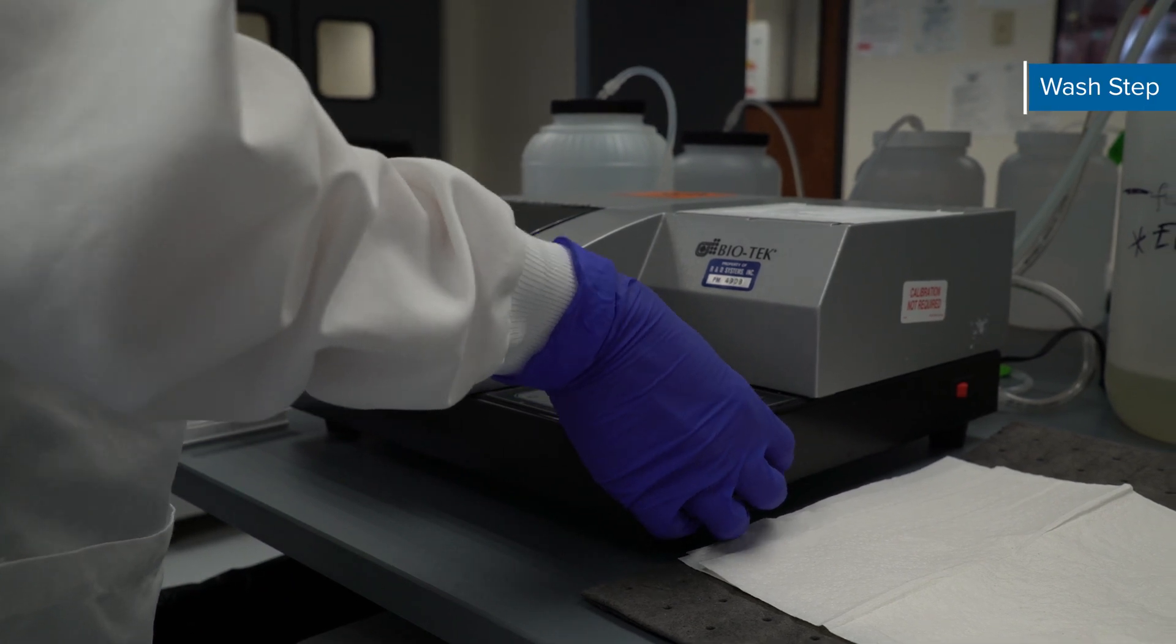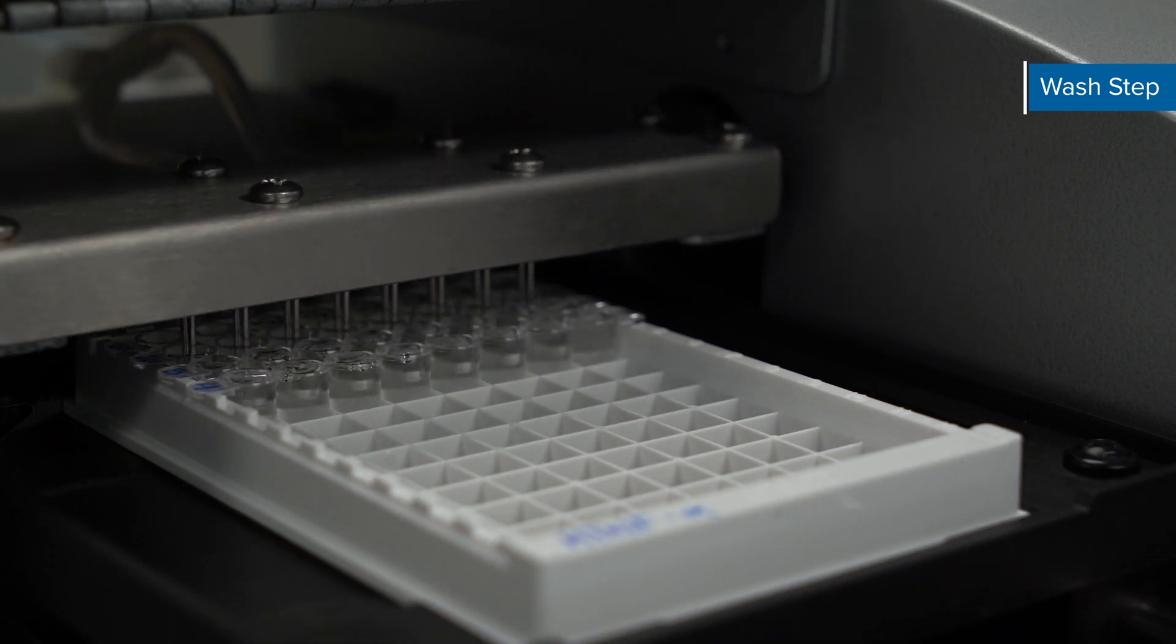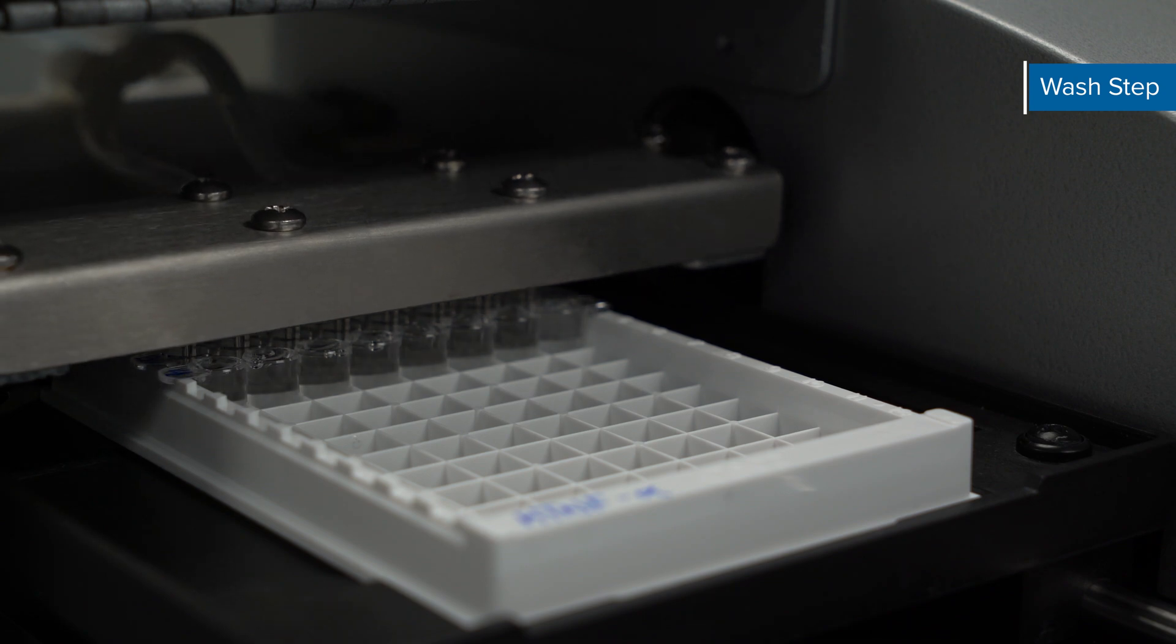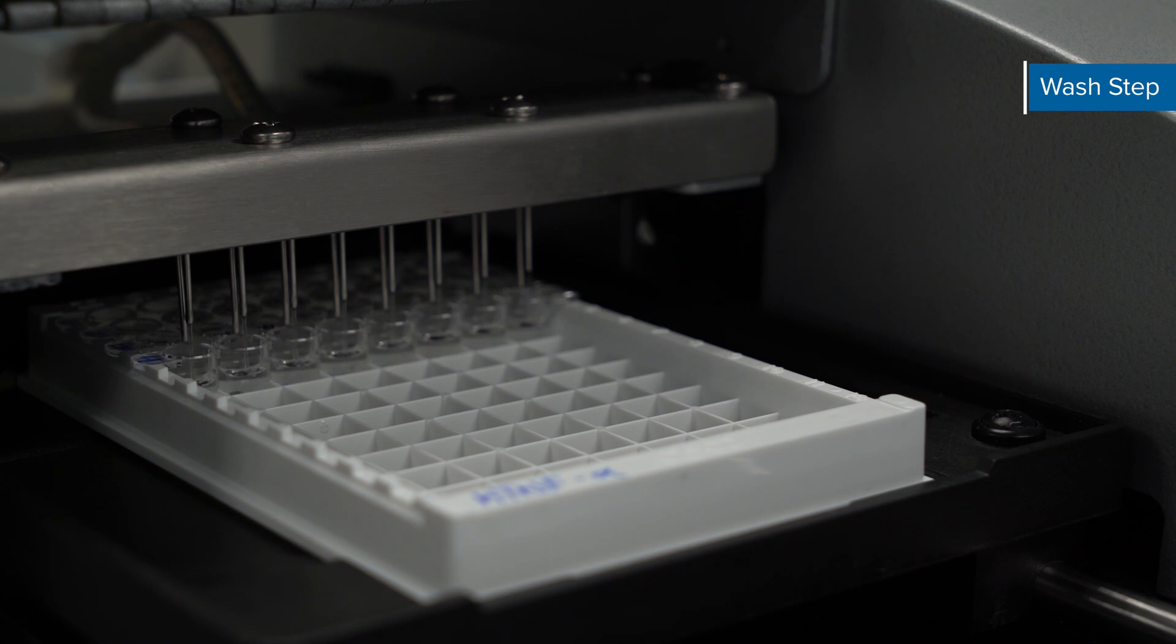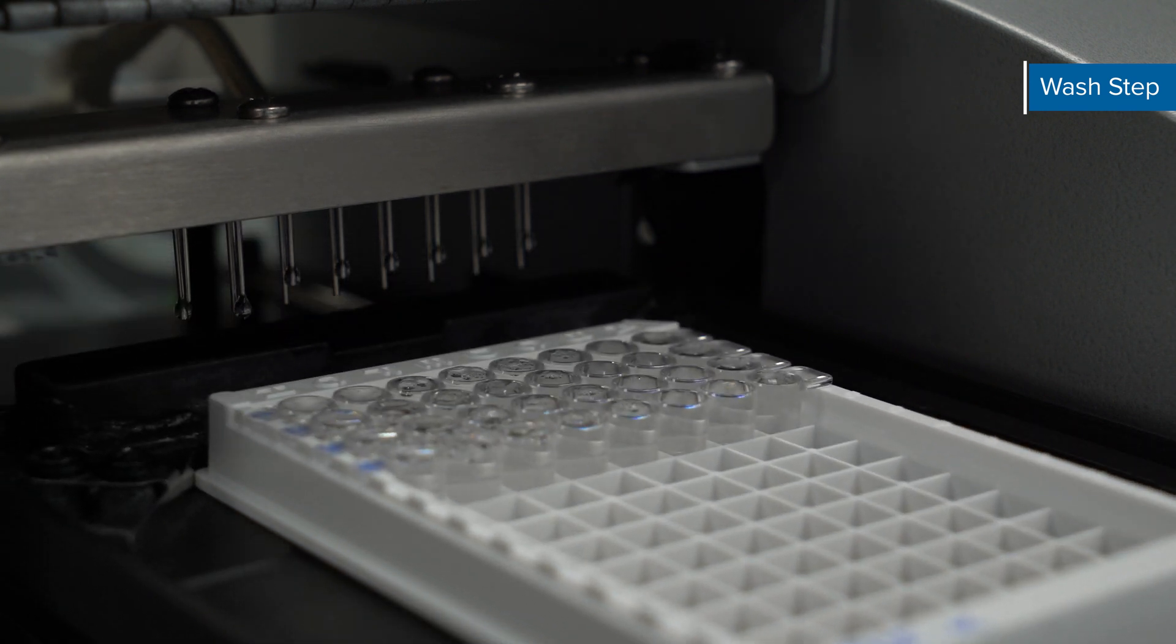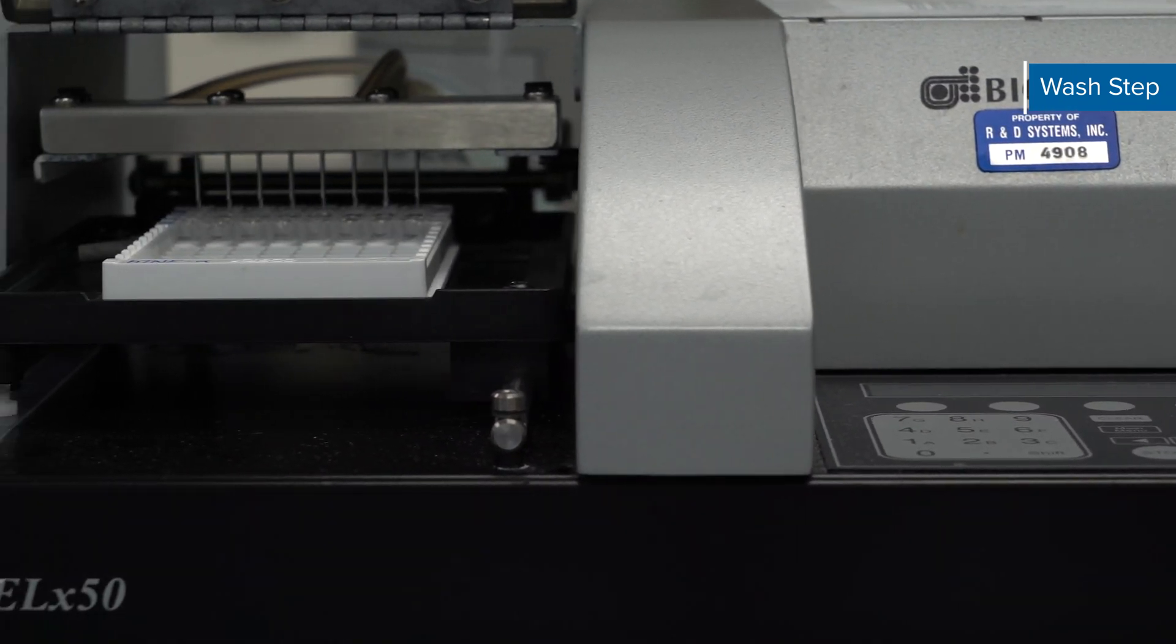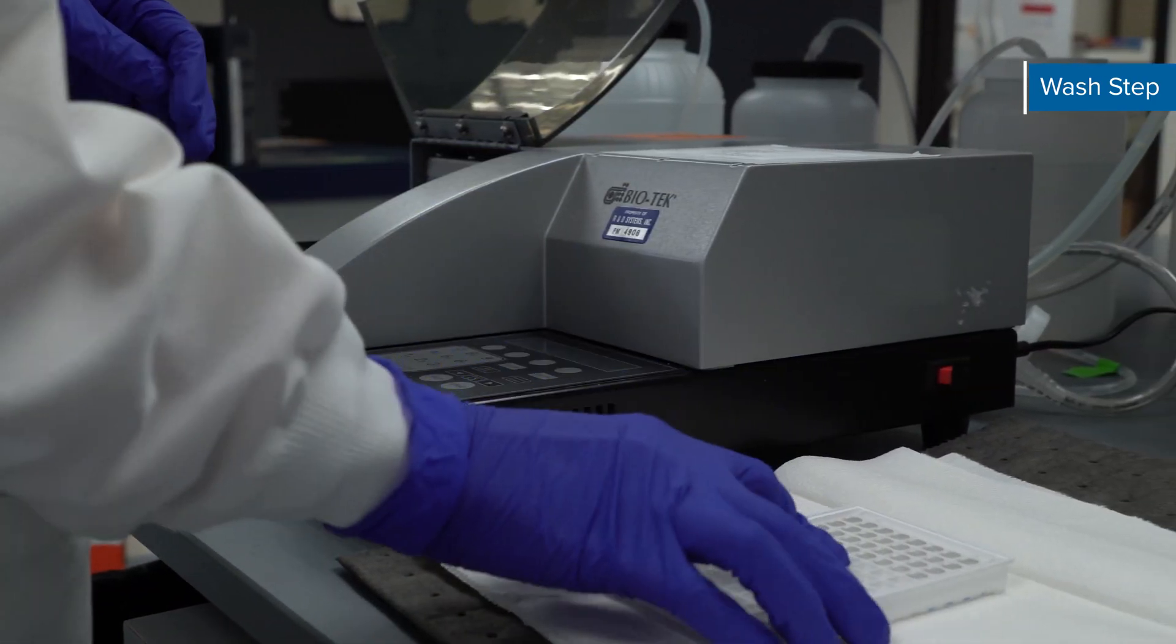Next, aspirate each well and wash by filling each well with 400 µL of wash buffer using a squirt bottle, manifold dispenser, or auto washer. Complete removal of liquid at each step is essential for good performance. Washing with a multi-channel pipette is too gentle and not recommended. We recommend adding a 30 second soak period after adding the wash buffer. Wash a total of three times and after the last wash, remove any remaining wash buffer by aspirating or decanting. Then invert the plate and blot it against clean paper towels.